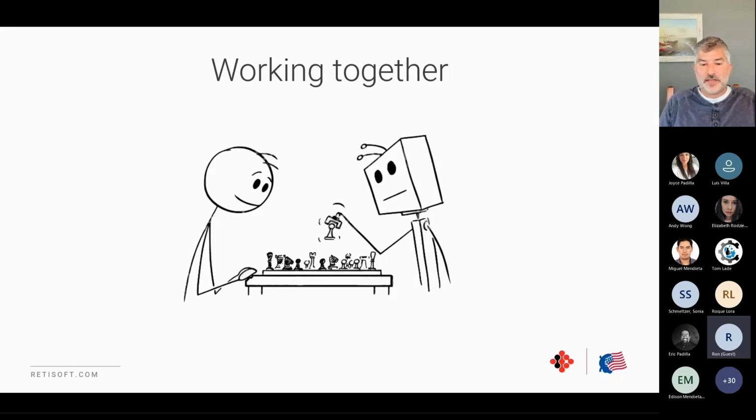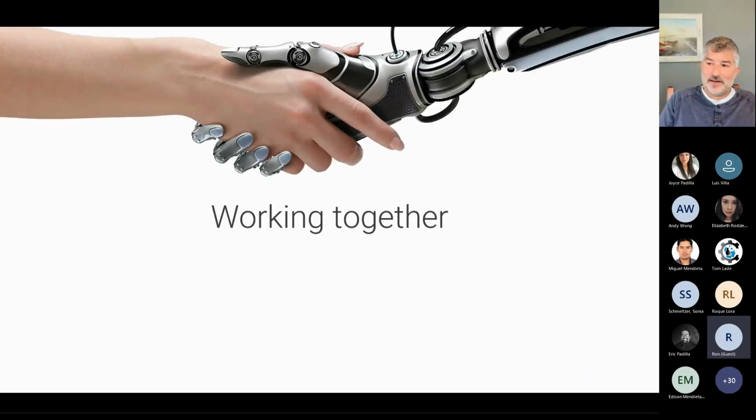But it's very important to understand and keep in mind that the automation is there to help the humans with mundane, repetitive tasks. It is not there to replace thinking humans. The thinking humans are there to instruct the robot, basically. The robots are not there to take over.